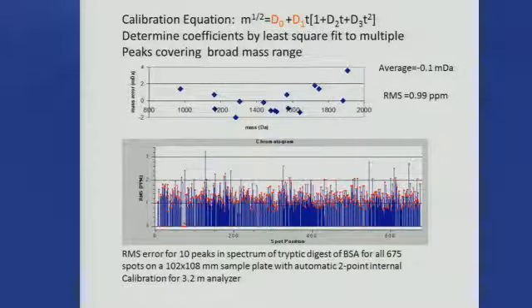It does depend a little bit on sample prep, but you can typically get RMS errors of on the order of 1 ppm to 2 ppm with a few outliers. So 1 to 5 ppm with a good reflector is now quite routine over a broad mass range. You do have to do some automatic internal calibration where you have at least one reference peak to correct for small changes in position of the sample, et cetera. But this also is pretty much available commercially from existing instruments.